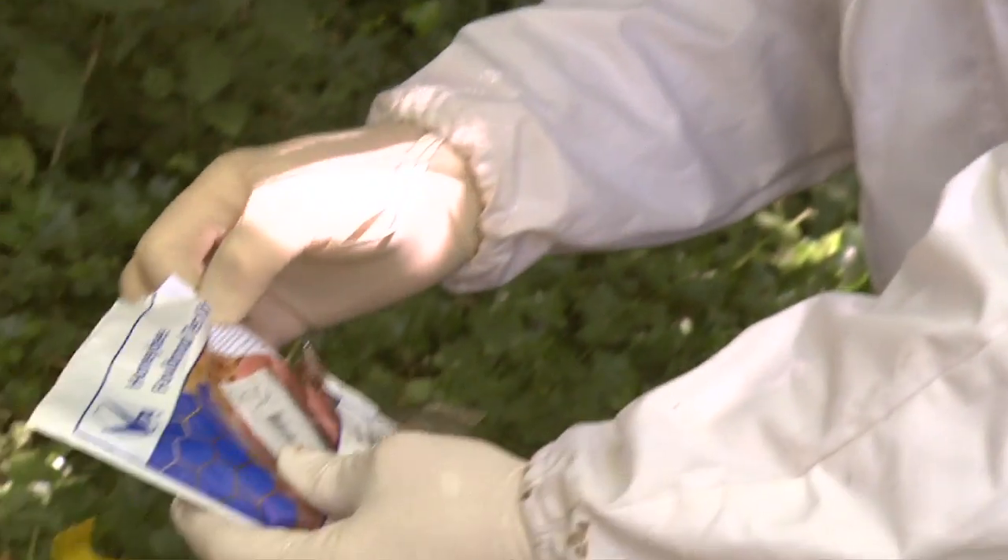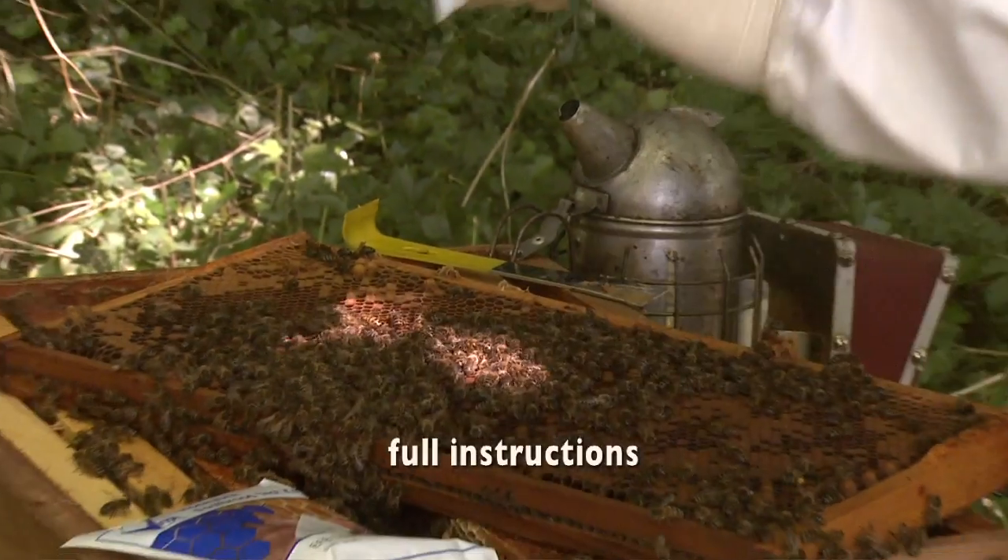If not treated or not recognised, colonies can die from this or it can be very debilitating. So obviously the beekeepers want to know if they see something in their hives, if it is European Foulbrood or not, and it's not always easy to see. So with one of these kits, which is based on monoclonal antibodies, we can tell within three minutes if that disease is European Foulbrood or if it's something which is not significant.